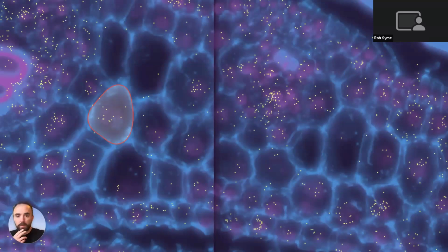Now, from here, we can follow a similar pattern to group the transcripts. We could sum, for example, the counts of all the transcript IDs over the whole image to determine the mean transcriptional profile of the slice. But we can turn this data into a single cell experiment by determining the boundary of each cell, shown here in red, and then grouping the transcripts by those cellular IDs. And then once you have these cellular IDs, you can do things like cluster the cells based on the transcriptional profile. But for our purposes today, we're just going to focus on the particular task of finding these cell boundaries, a really important and crucial part of this workflow.